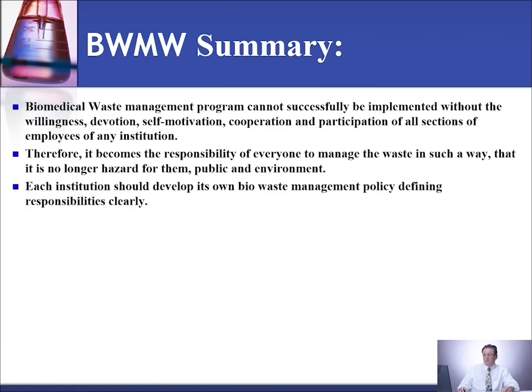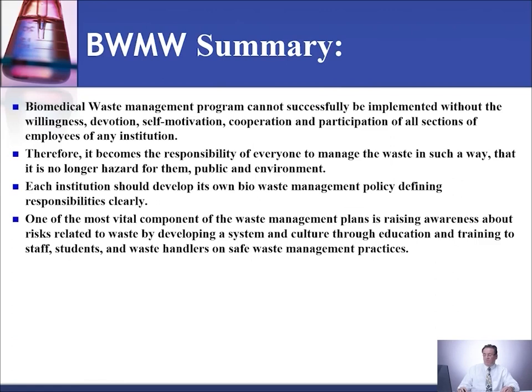Each institution should develop its own biomedical waste management policy, defining responsibilities clearly. One of the most vital components of waste management plans is raising awareness about risks related to waste by developing a system and culture through education and training of staff, students, and waste handlers on safe waste management practices.